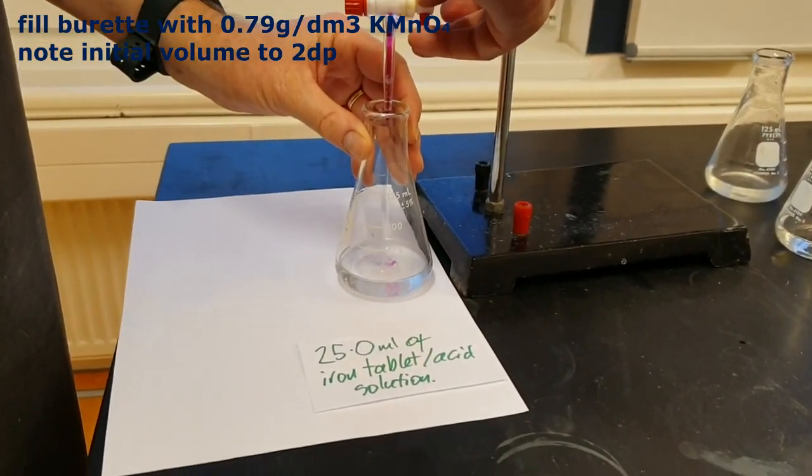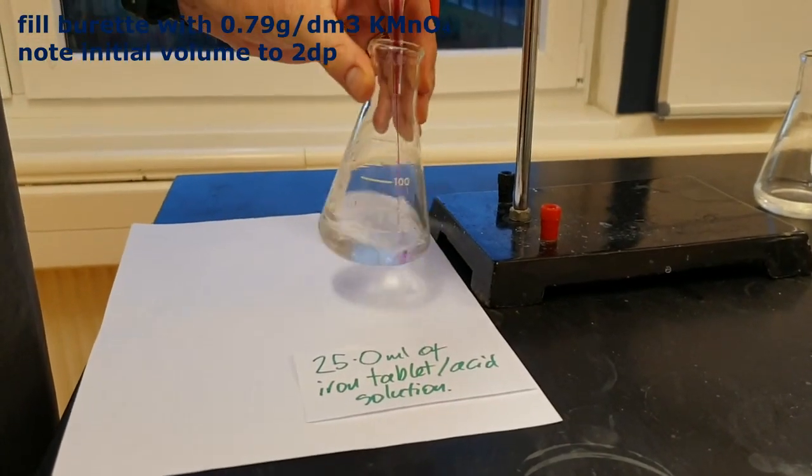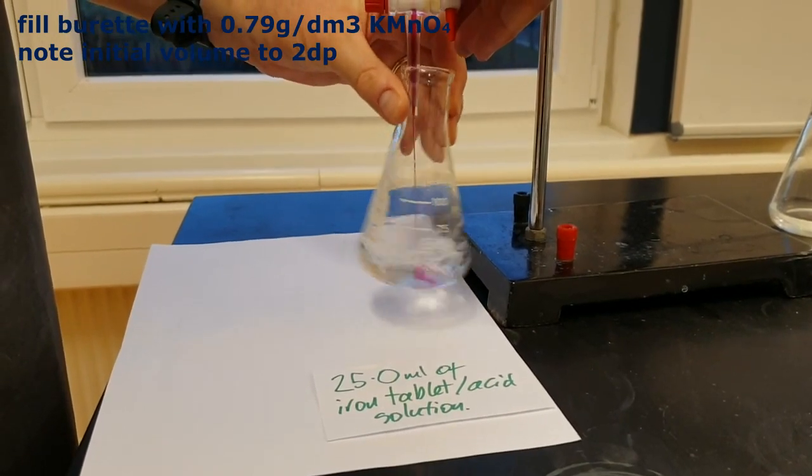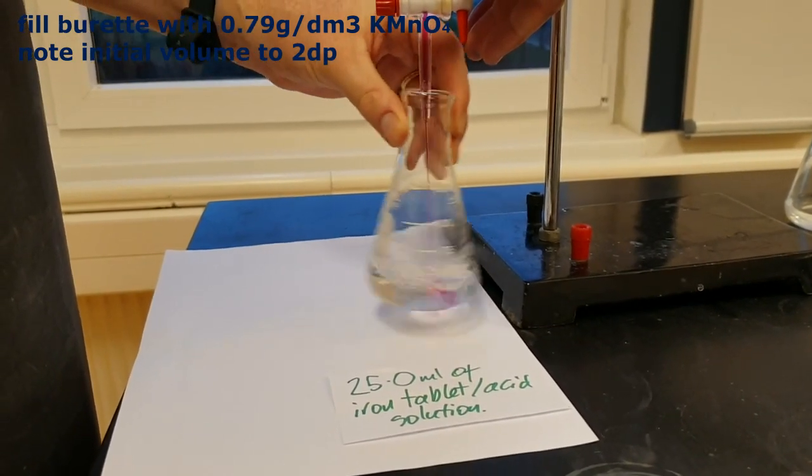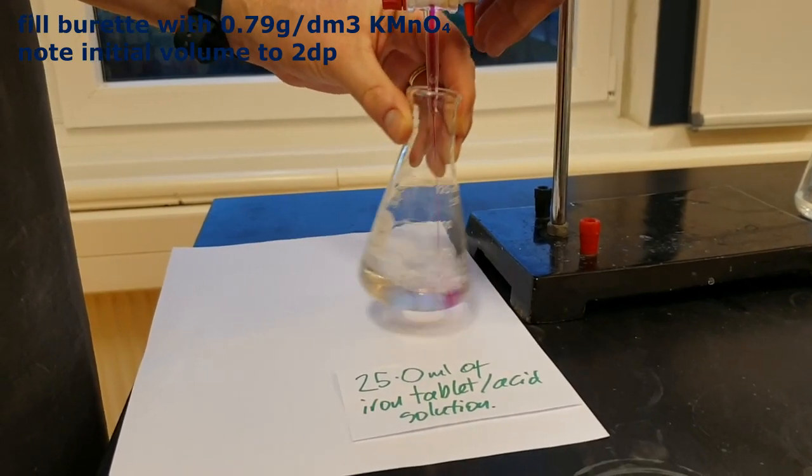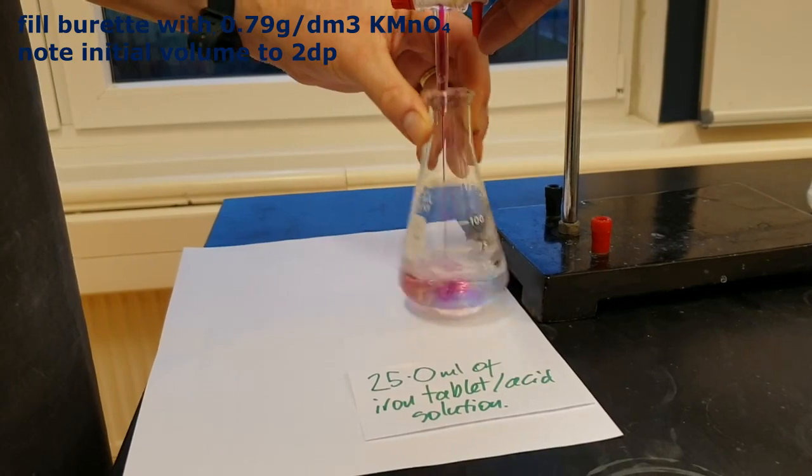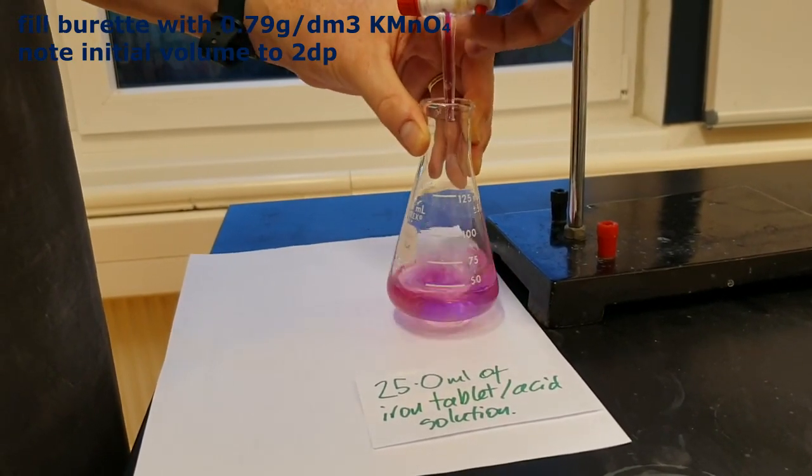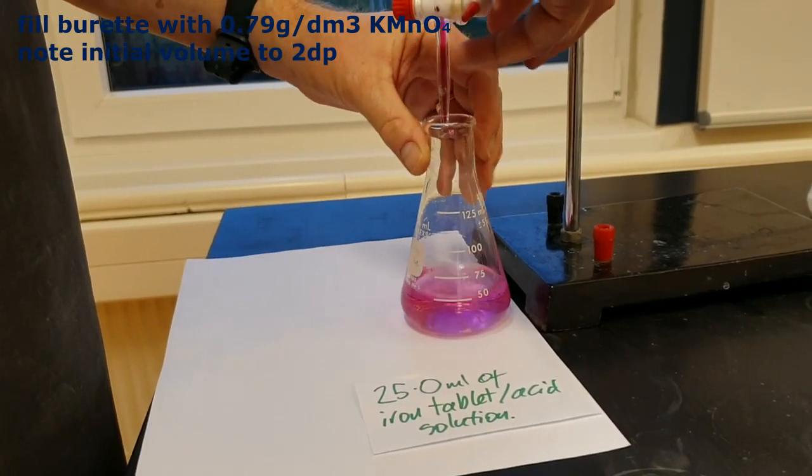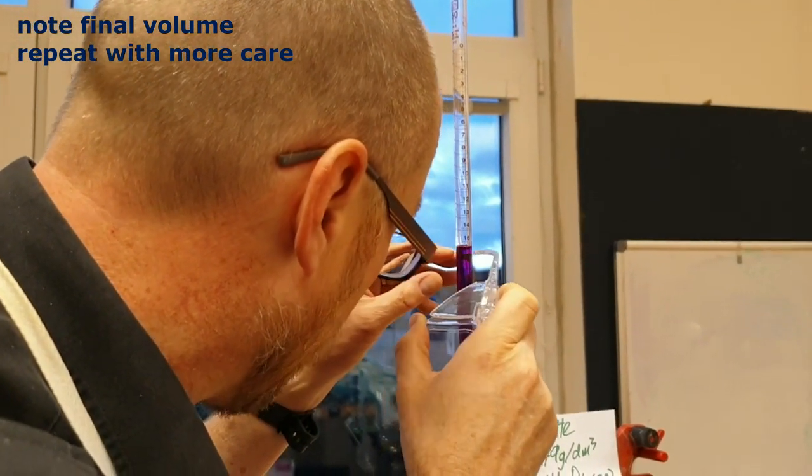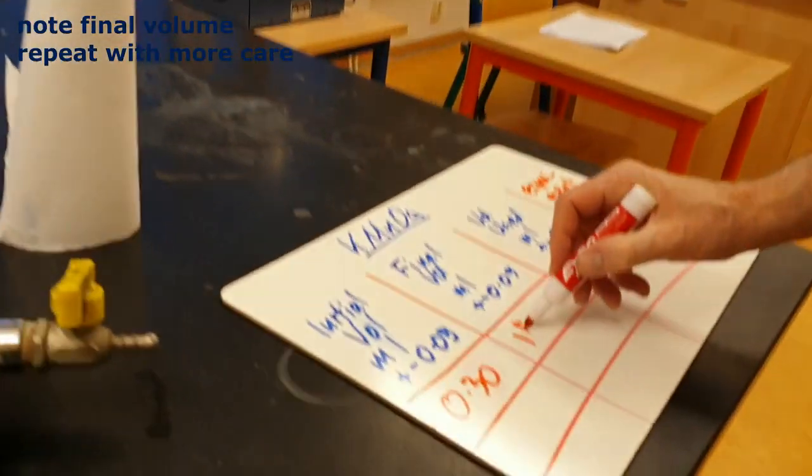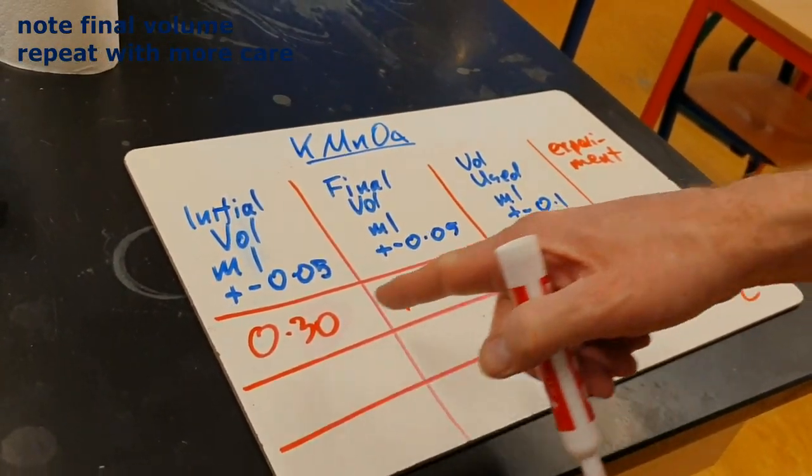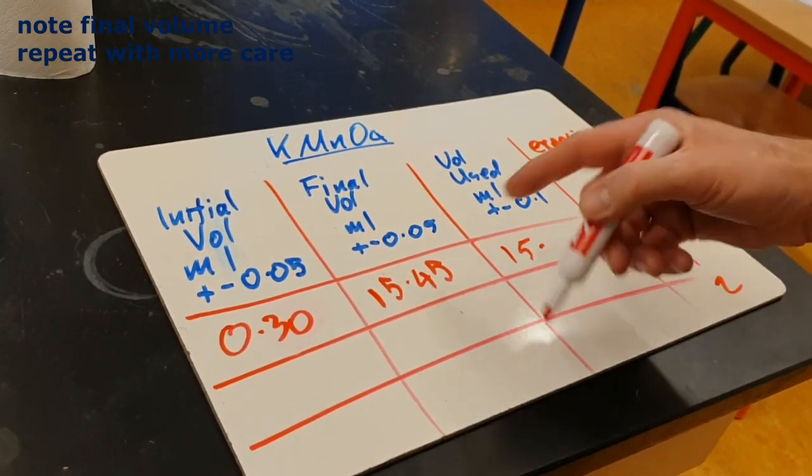And it's self-indicating. When the purple colour remains, the experiment's over. Okay, that's over. And that gives me a volume of 15.45 millilitres. So 15.45 millilitres. And that gives me the total volume used is going to be 15.15.